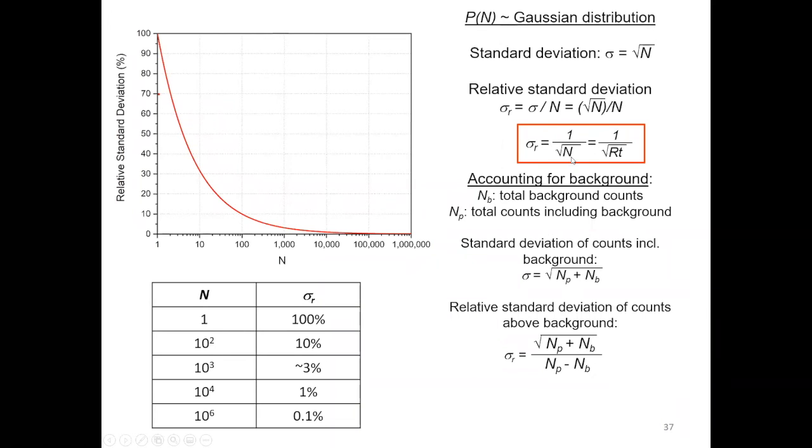Now the challenge is that not all the data will give you all that information. Here is one example, two impacts we have. One is for the scanning speed and the other for step size. The scanning speed is how fast you collect the data. Some people that are always in a hurry will collect the data at very fast speed.